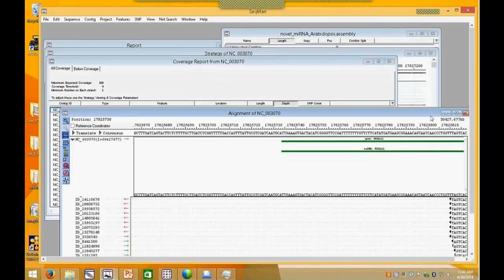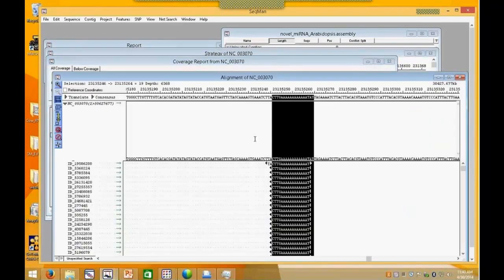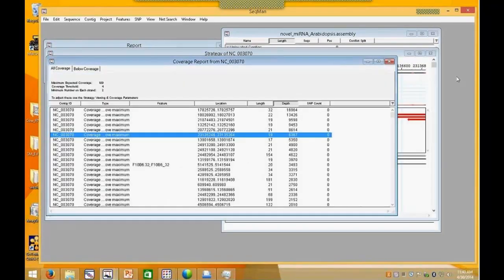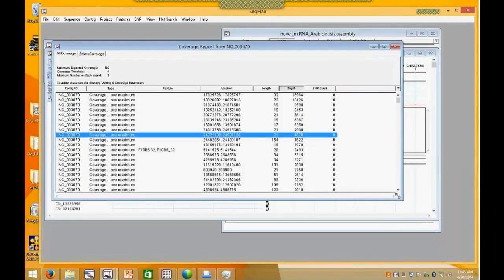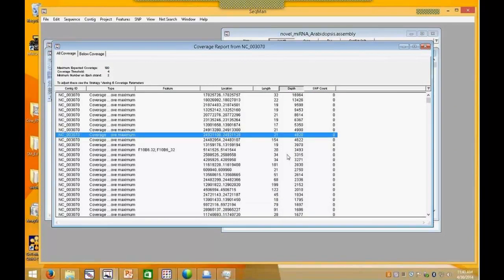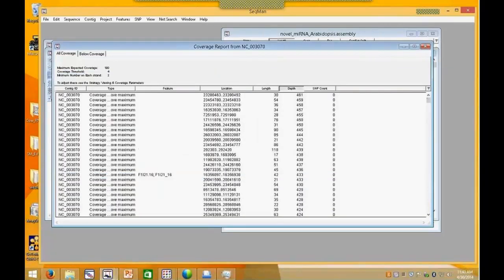And so I might work through this report then and look for, are any of these aligning? There's probably some noise, so I can do it pretty quickly. There's another one aligning to a non-coding, so maybe my database sequence is updated, or maybe that's the best I can get and I need to append to it. So again, depends on what your needs are.